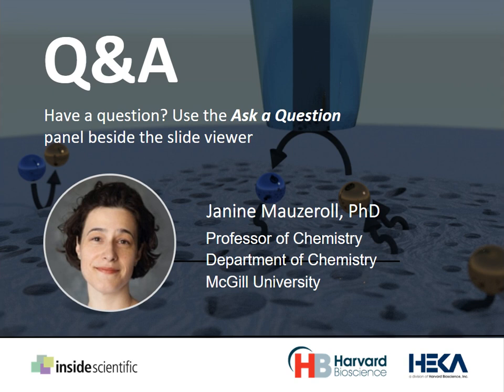So I would say you can also, I think there's also a nice group in Germany that used SECM to monitor dendrite growth at lithium electrodes. And so I'll have your question and I can suggest a couple of papers specifically for battery materials if you're interested.